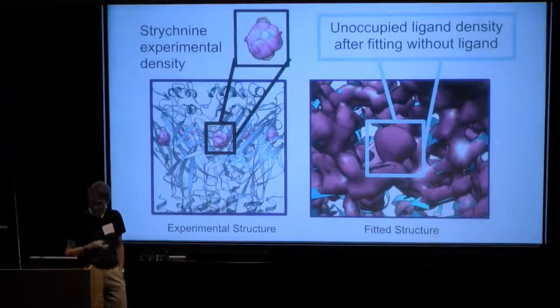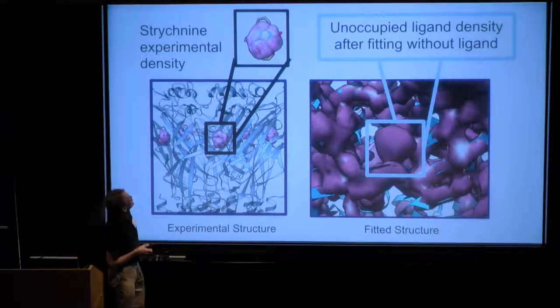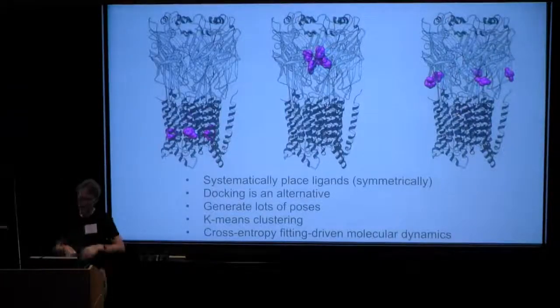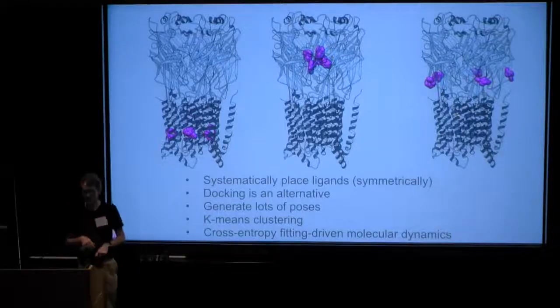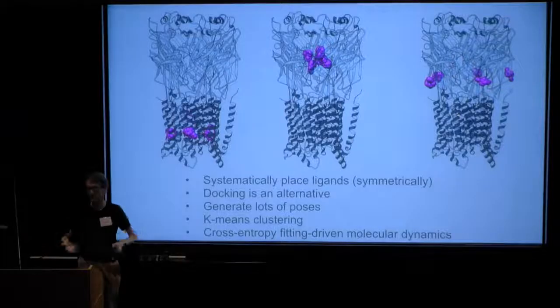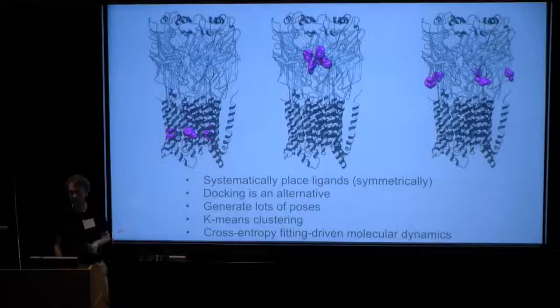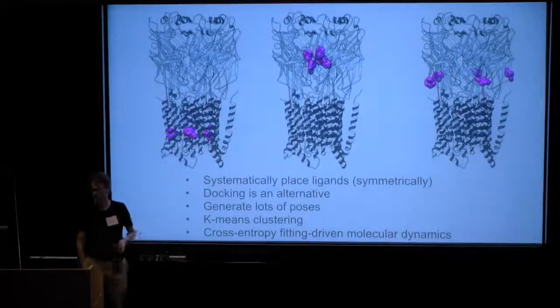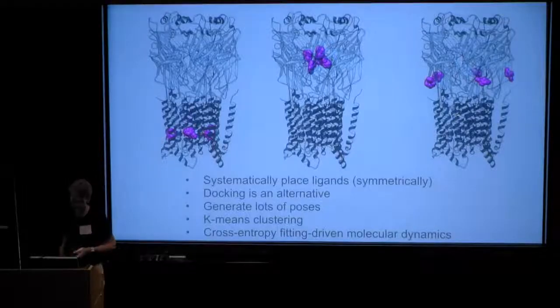So if we now start this, but remove the strychnine, but keep the density there. It's a fairly low density. It's not like, well, I'm not sure about you, but I can't say what the orientation of that molecule should be, so that's probably based on guesswork. At some point, we're going to need to have these molecules in reasonable proximity, otherwise it's going to take an eternity. So what Joe did is we can place these molecules randomly all over the system. If we place them very far away from the protein, we don't care. If you would like to be slightly smarter, maybe we should place them with docking or something. But then we cluster things with, well, either k-means clustering or any grouping so that we have maybe 10 different candidate binding poses or 100 or so. This is a very fast calculation, so it doesn't really matter how many we pick.